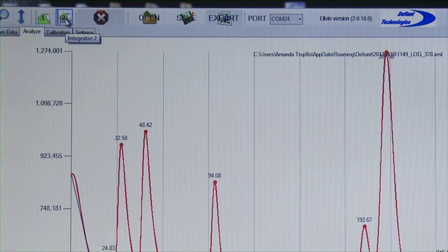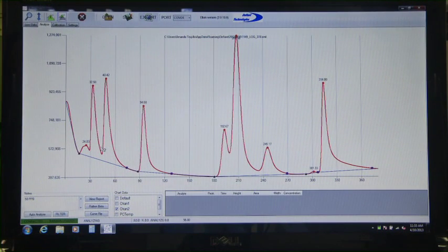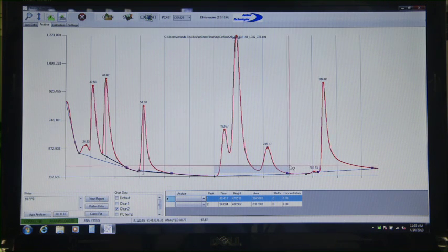Elvin's Integrator 2 is used to determine the area under the analyte peak, the height of the peak, and the time the peak reaches the highest point, which is the retention time. Integrate each peak that corresponds to a calibration analyte. Multiple peaks can be grouped for integration.